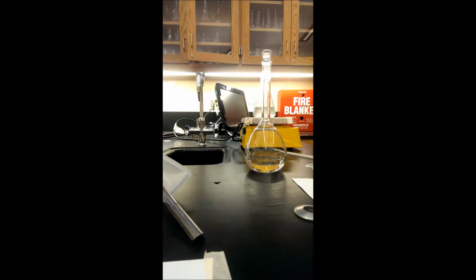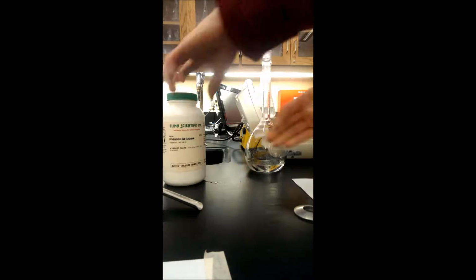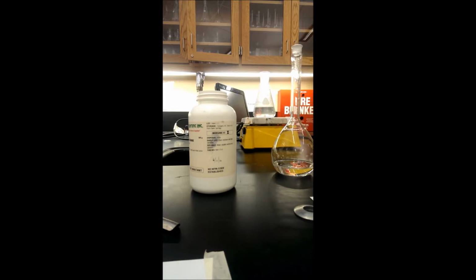Unfortunately, I did this wrong because since potassium iodide has mass, I ended up making the solution greater than 500 milliliters, so I had to do it over again. You can see the first time I had a very difficult time measuring out that potassium iodide. There's a lot of potential errors here at this point in the experiment. The weighing and measuring of water and all the other substances later on will always have a bit of error in them, so that's something to factor into the calculations.